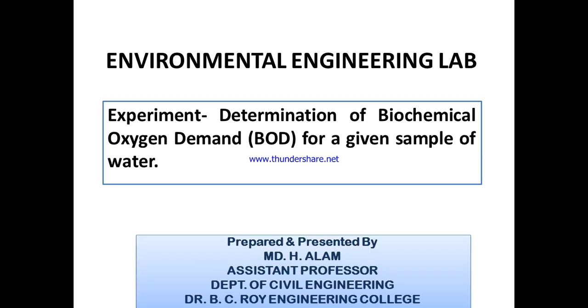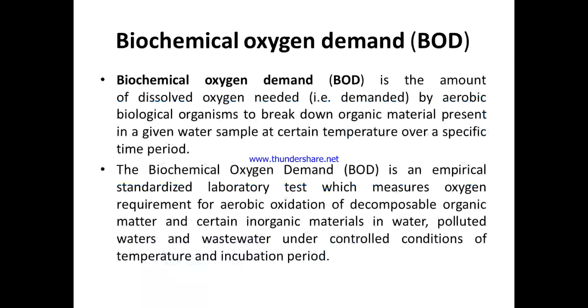Okay, you know dissolved oxygen is present normally in water, and with time the dissolved oxygen level depletes. With the passage of time, the dissolved oxygen level keeps on decreasing. So as the time goes on, the dissolved oxygen level decreases. So basically initial DO is always going to be higher with respect to, say, the 4-day or 5-day level of dissolved oxygen. In the same water sample which had an initial amount of DO, after 5 days if you check, you will notice that the DO level has depleted.